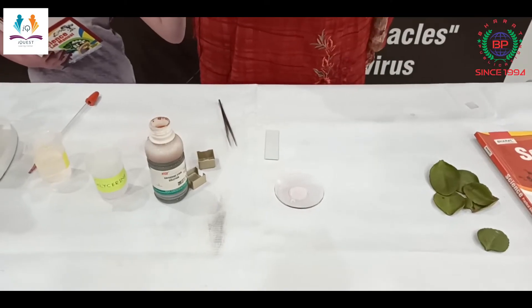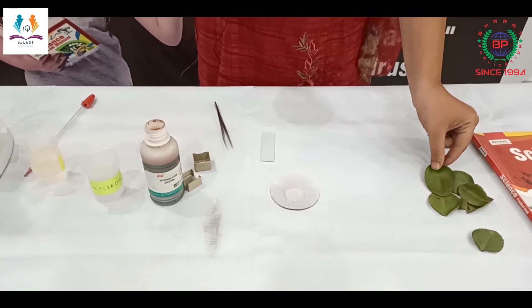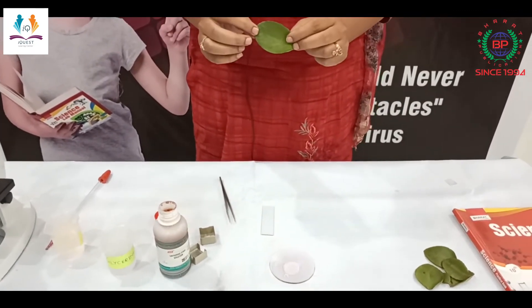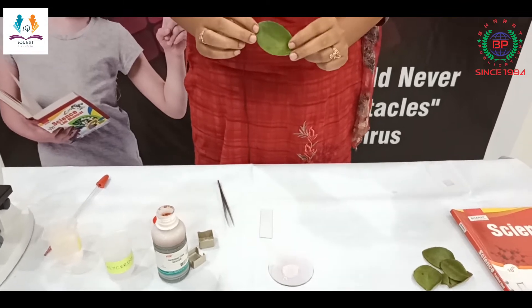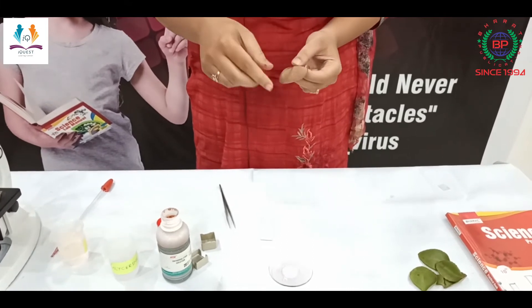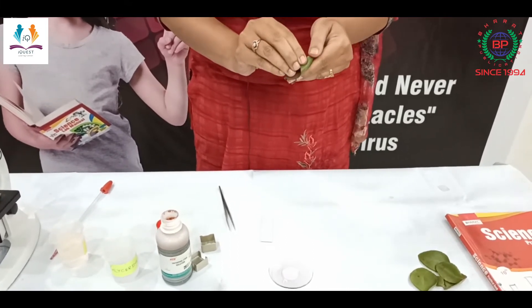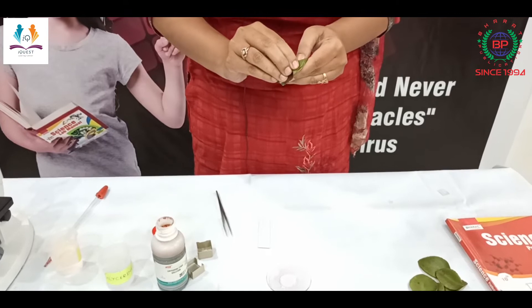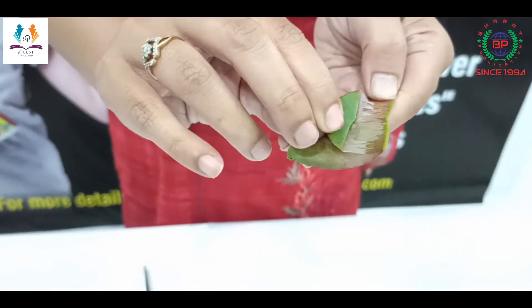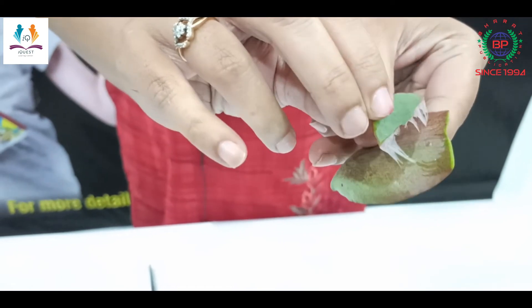Let's start the procedure. Firstly I have taken a leaf and washed it. As you know, epidermis is on both sides — upper epidermis as well as the lower epidermis. I am going to remove the lower epidermis by pulling this leaf in the opposite direction, and I have got this epidermis. Now I will transfer this epidermis into the water.